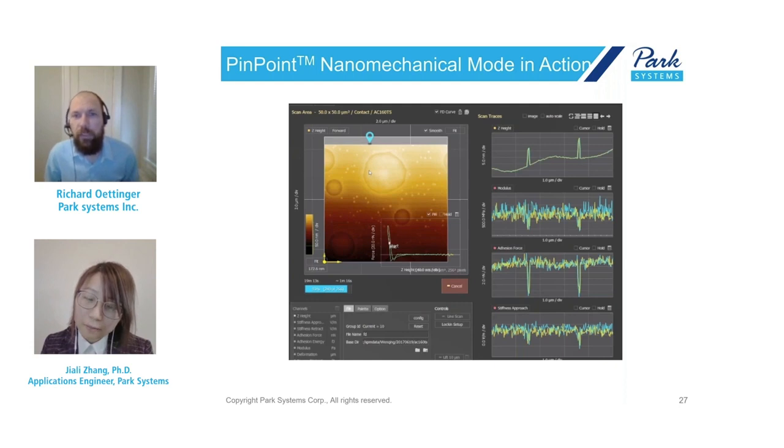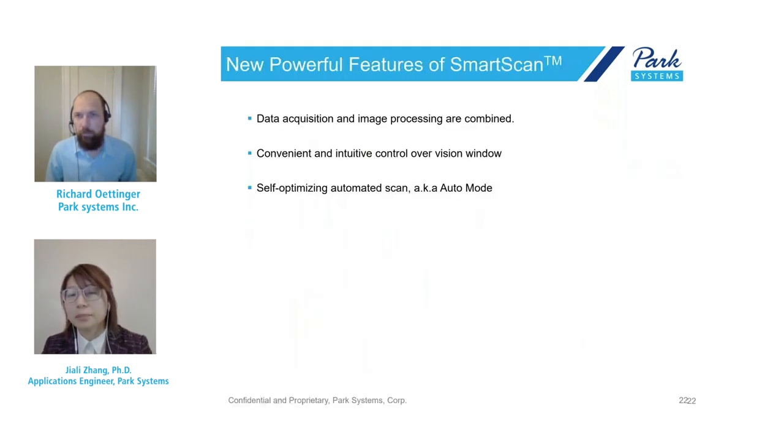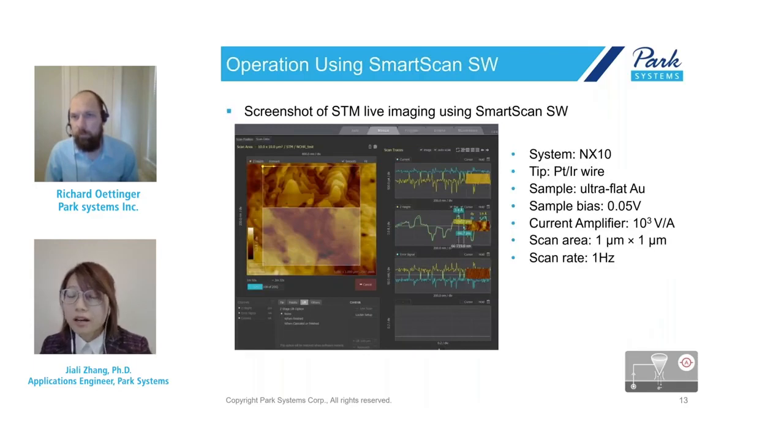Okay. Can STM be used to study the surface of non-conducting organic molecules self-assembled on a metallic surface and get to know the alignment of molecules? I would say the answer is yes. As long as you deposit the molecules onto a metallic surface such as gold or HOPG, you are able to see the self-assembled monolayer on the surface. So a lot of researchers do simple STM experiments using SAMs and deposit them onto gold to see the self-assembled monolayer on the surface.